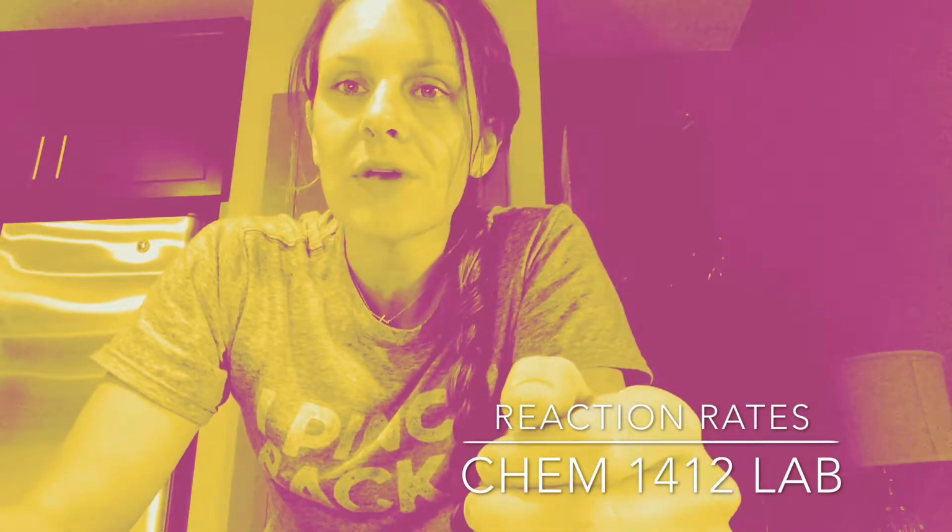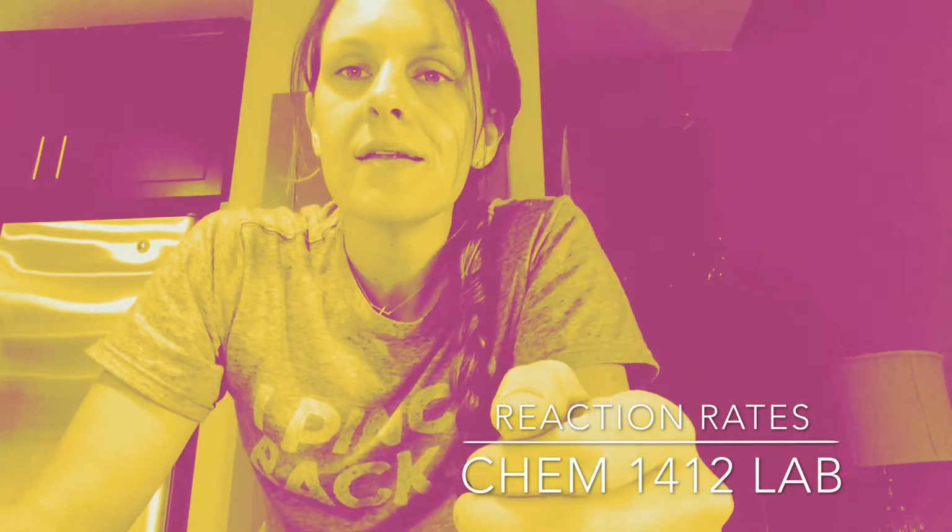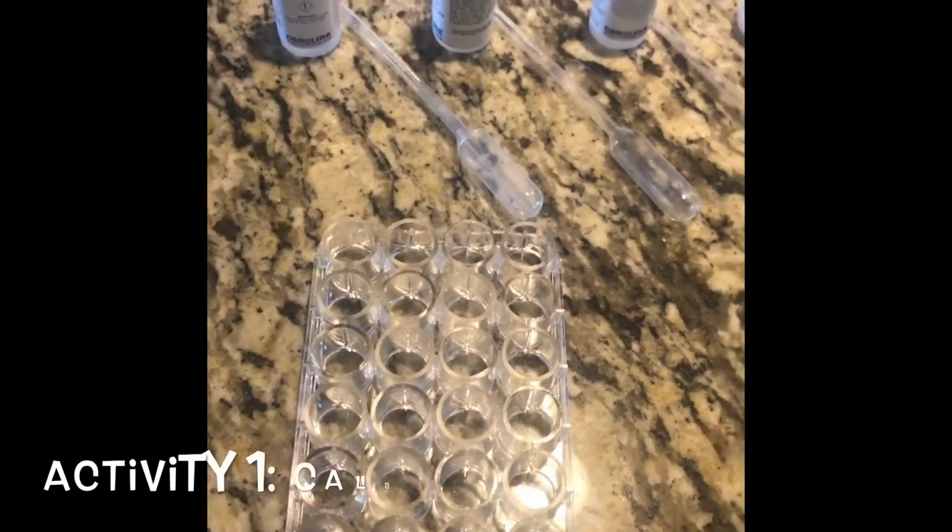This is chemistry 1412. I'm doing factors affecting reaction rate this week, and it is 10/9/2019. Let's get into it. What we're doing is a calibration test.